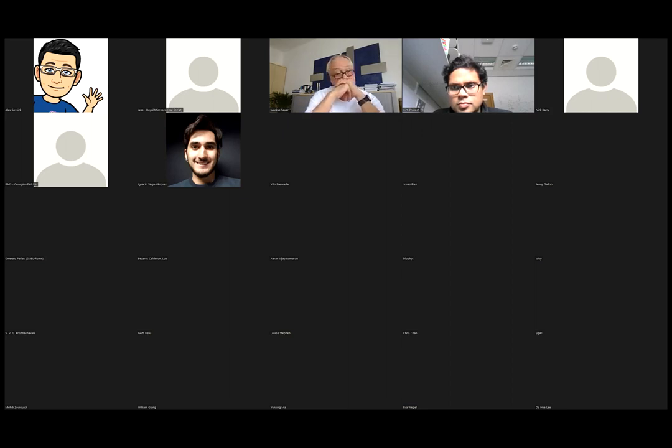I mean, it's just, again, the limitations STED microscopy has concerning dyes, but dSTORM is worse. For dSTORM, you have to use either a few of these Alexa dyes, or in the ideal case Alexa 647 or Cy5, and you have to re-embed the sample. In STED microscopy, you do not have to re-embed, you just have to take care that your fluorophores survive STED imaging.